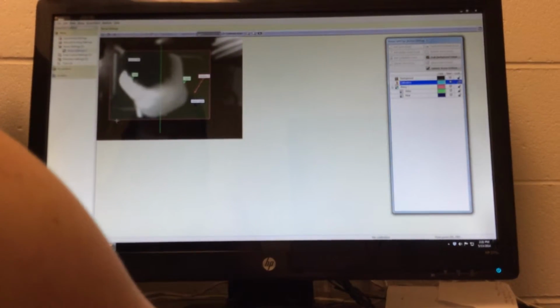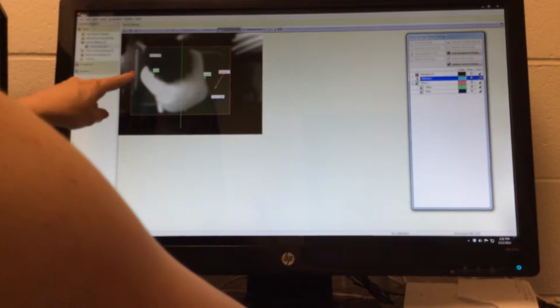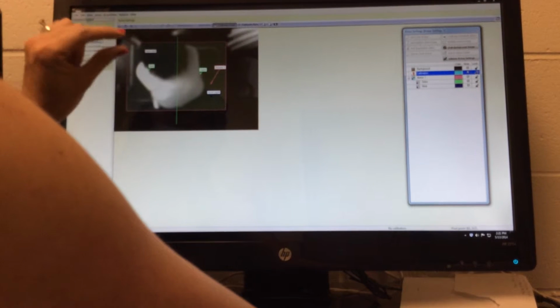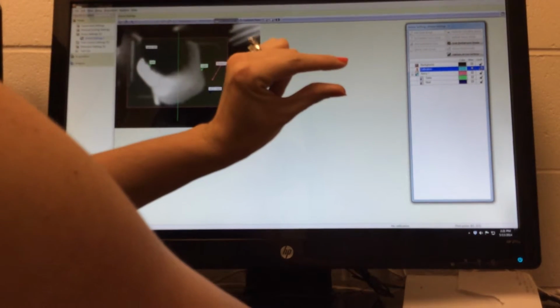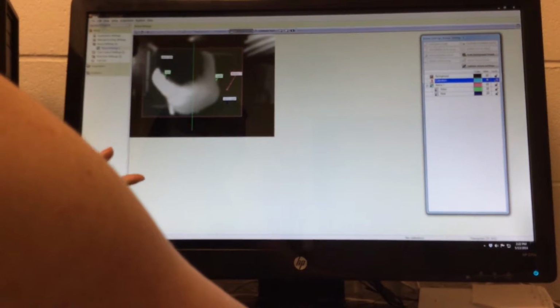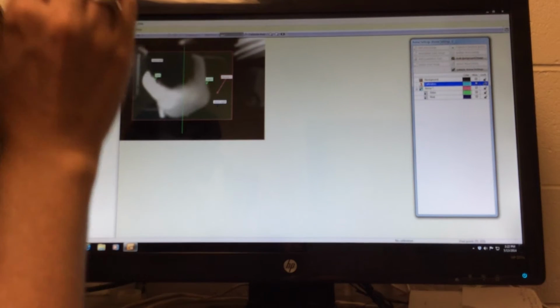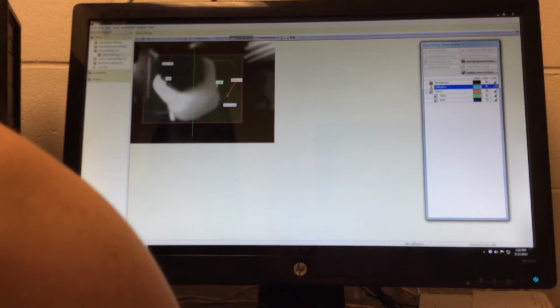Okay. So I say okay, and then I'm just going to draw a line within. Now here, if I've drawn the arena slightly larger, I want to make sure to do this as exact as possible across the arena itself, because from this measurement, it's going to calculate distance traveled, velocity, things like that. So you want this to be as exact as you possibly can.